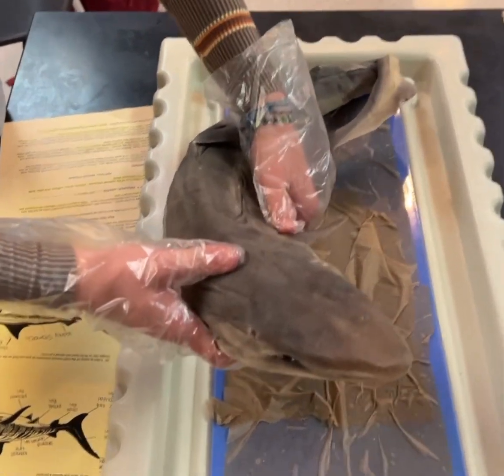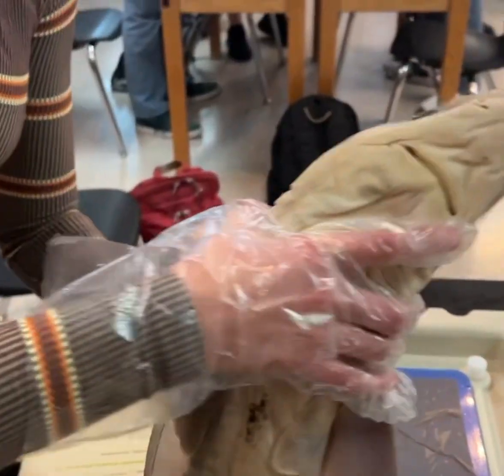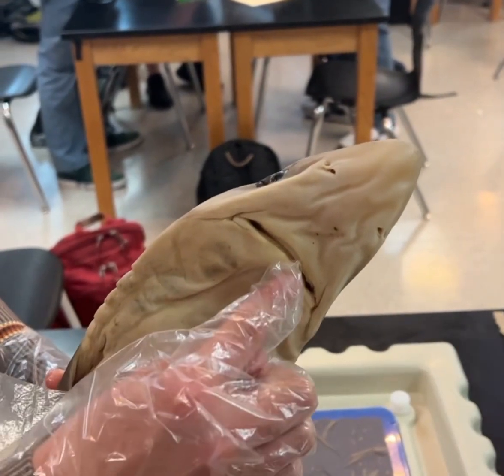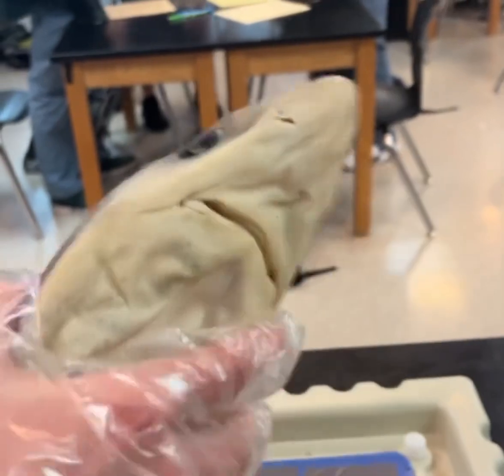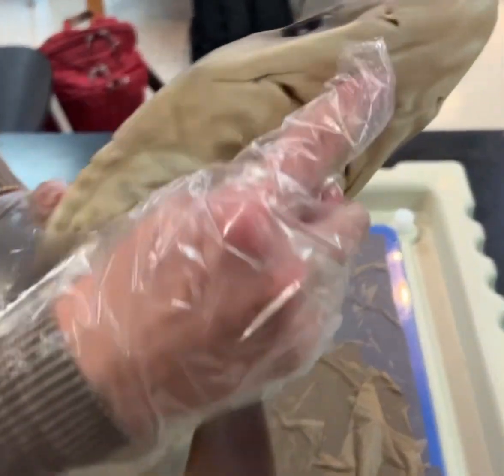Okay, this is Charcuterie Michelle the Shark. Oh my god. This is her upper jaw. That's her lower jaw. That's her teeth. That's her ampulla of Lorenzini. This right here is her eye. That's her spiracle. Her nostrils are right here.